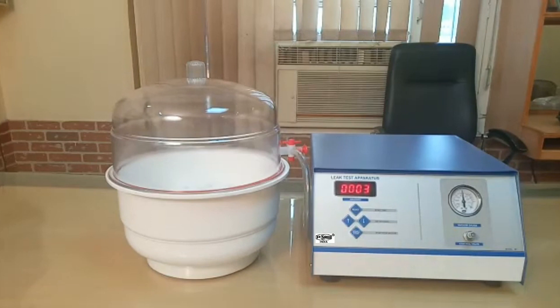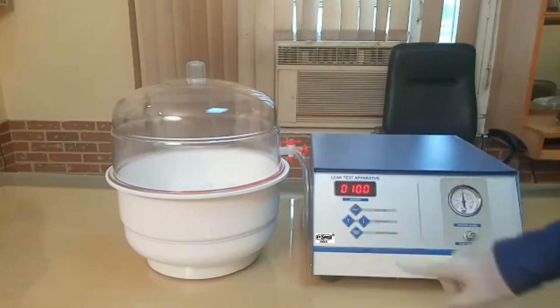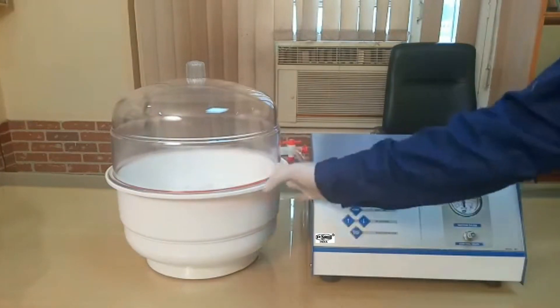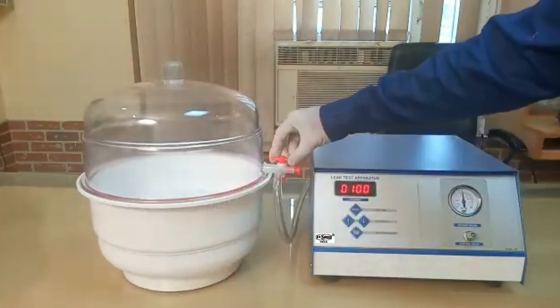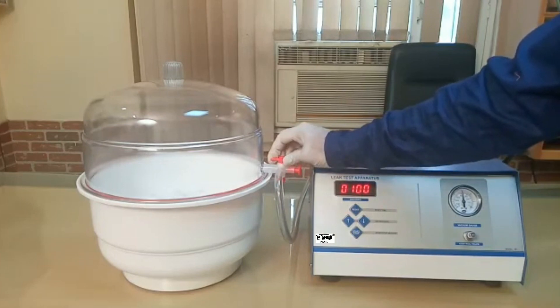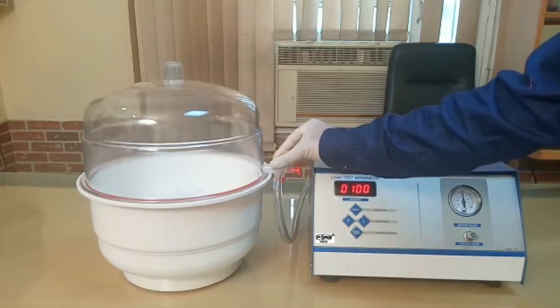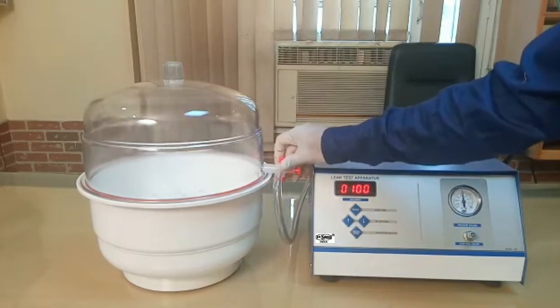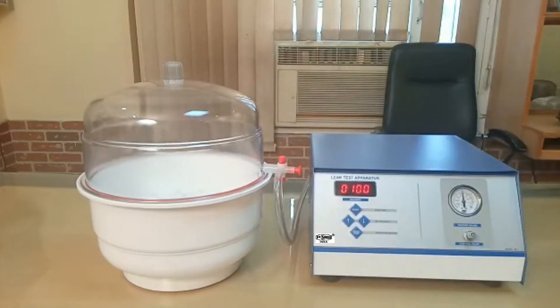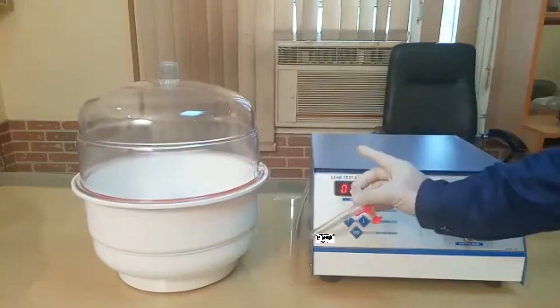At the end of the process, the display will start blinking. To stop the beep sound, press the stop key. If you want to release the pressure, turn this knob — this is the knob notch — and rotate it slightly to release the vacuum very slowly in a controlled way.